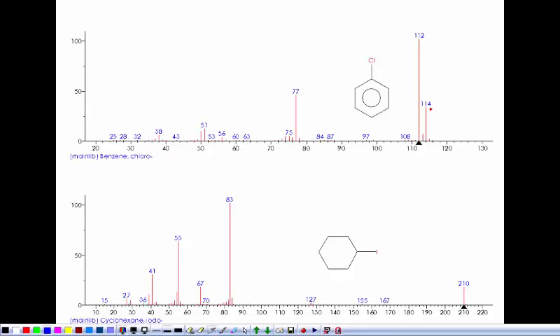And so at the drinking water plant, they have to analyze the water sample for what are called chloro-organics or bromo-organics. They look at the mass spectrum to see whether they've got a chlorine or a bromine in there. Too high a concentration is not good in drinking water. So they constantly have to test the drinking water to make sure that these chlorinated and brominated organics are not in the drinking water and measure their concentration.